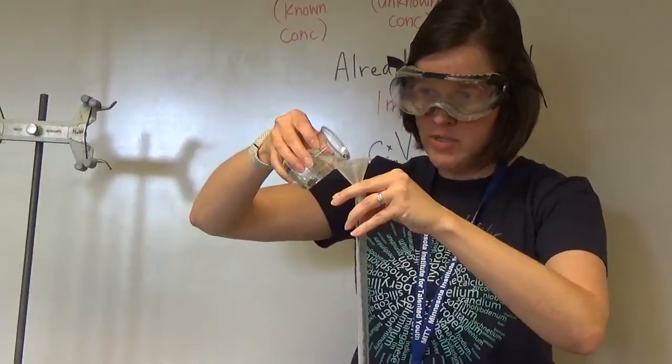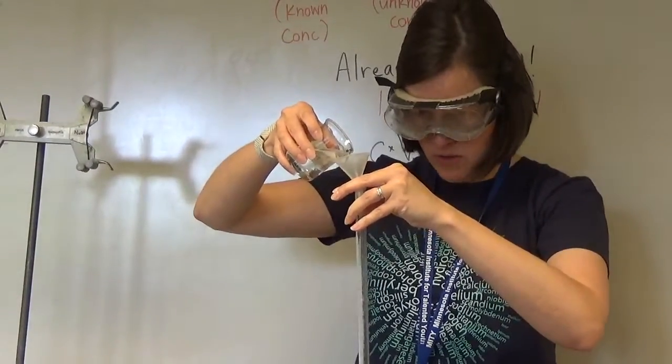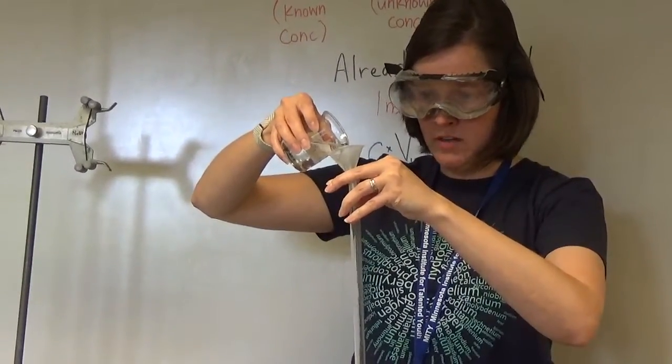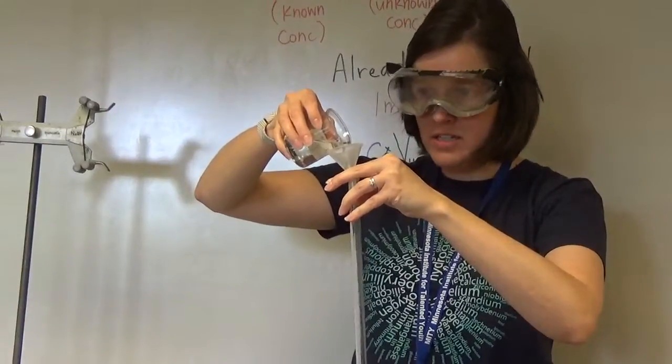Now, if you happen to overfill, so you go above the 0.00 milliliter line, you can just release some of it, whatever is at the top over an excess, into the waste container.